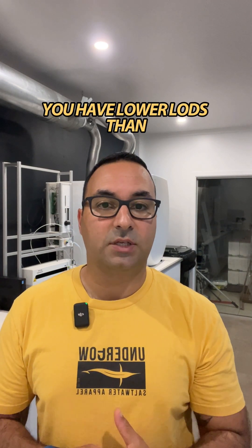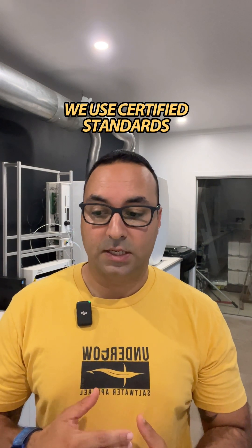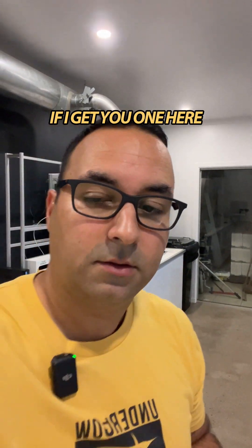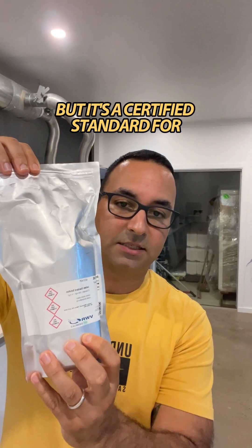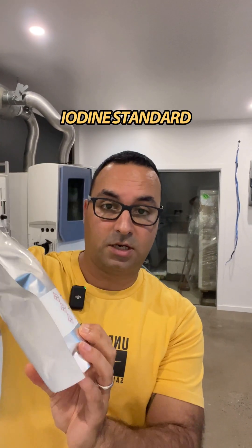If you were in freshwater you would have issues — you'd get lower LODs than you would actually measure in reality. We use certified standards. Let me show you one here — this is a certified standard. They're packed in dark packaging so they don't get too much light. This particular one is an iodine standard.